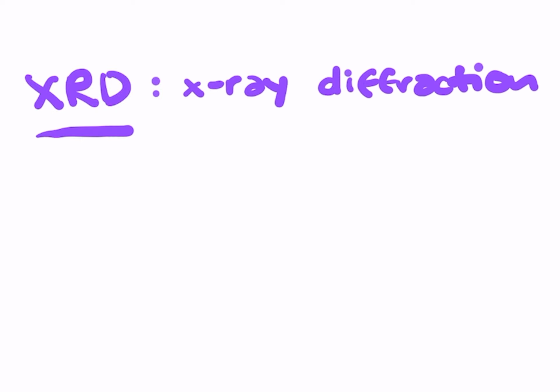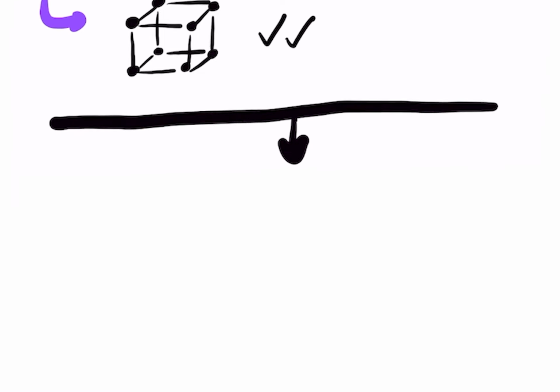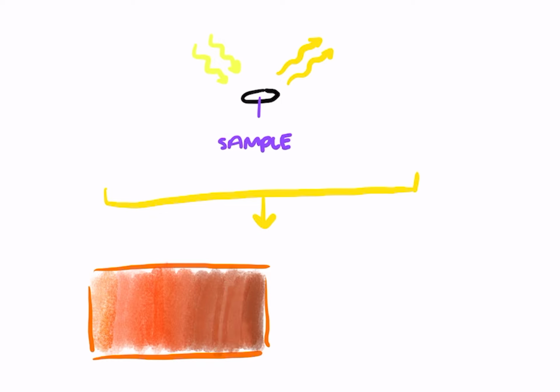Emily also showed me how X-ray diffraction, or XRD, is performed. XRD is a technique that is used to collect data on crystalline structures to confirm their atomic arrangement, and whether or not the desired product was made successfully. During X-ray diffraction, X-rays are shined on the sample, and then diffracted in different directions. This can be recorded as a spectrum, and can be compared with known data on the sample to see if the synthesis was successful.